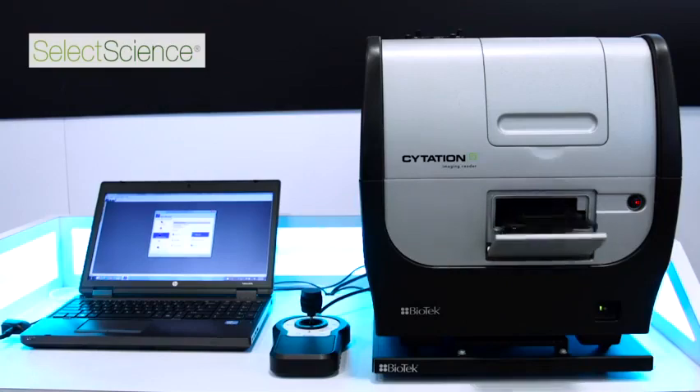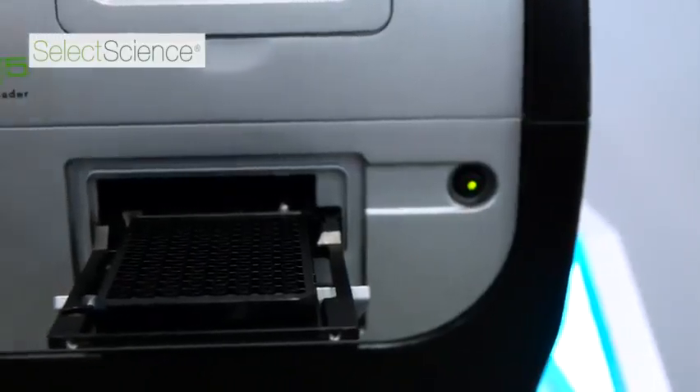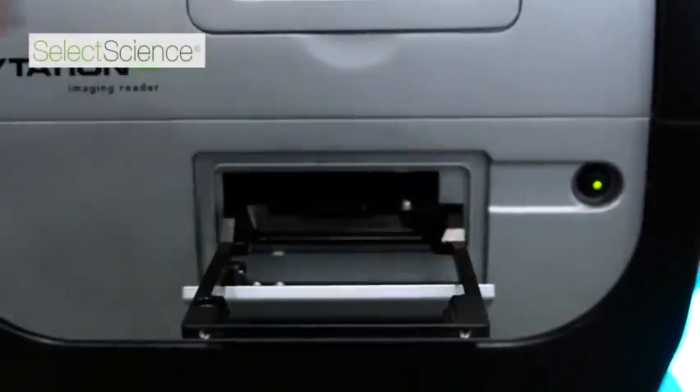The combination of Corning's microplates and the Citation V allows you to do a number of different types of assays — obviously microplate reader assays that you would normally perform, but also now with the incorporation of their clear bottom tissue culture treated plates.